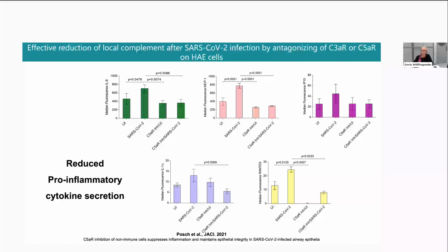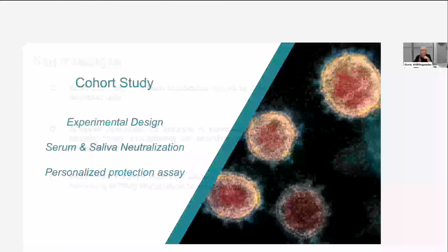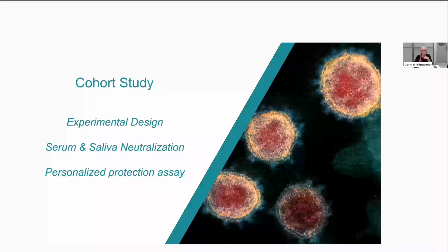In Italy there were case reports where they added complement inhibitors, and by this could really rescue the patients' lives. So we think that the system nicely reflects reactions going on in the patients, and when always comparing it with patient data from the literature, this makes the picture rounder. Also, this is, as said, not such a complex system, because here no immune cells are added.